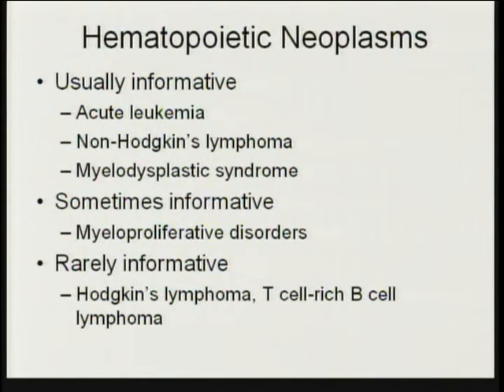There are a subset of myeloproliferative disorders where flow cytometry is also useful, although there are certain subclasses, particularly polycythemia vera and essential thrombocytosis, where flow cytometry doesn't do a particularly good job at this point of identifying those disorders, and molecular testing may be more appropriate.